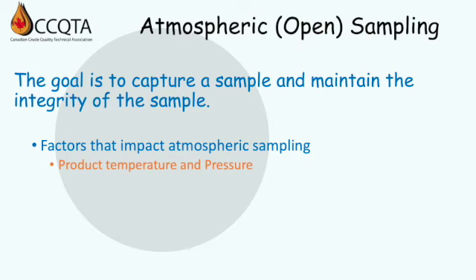However, keep in mind that the pressure may simply be from pump discharge pressure and the pressure may be independent of the product. Again, it's best to understand the product you are sampling. Ambient temperature. If the ambient temperature and thus your container temperature is higher than the product temperature, such as in a cold tank or an underground line, then the introduction to a warmer environment will increase the vapor pressure and promote evaporation and loss.